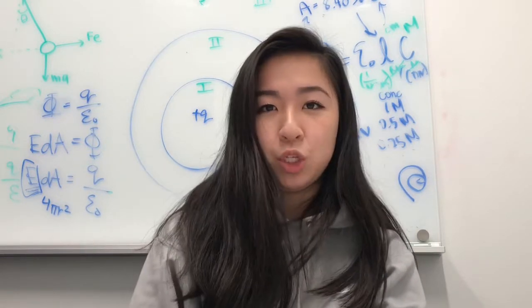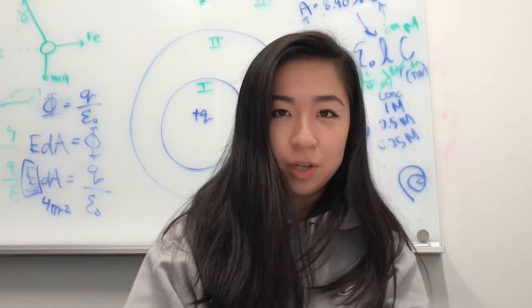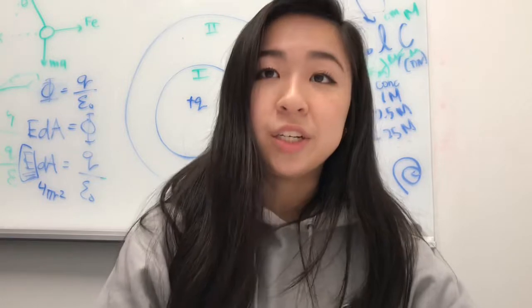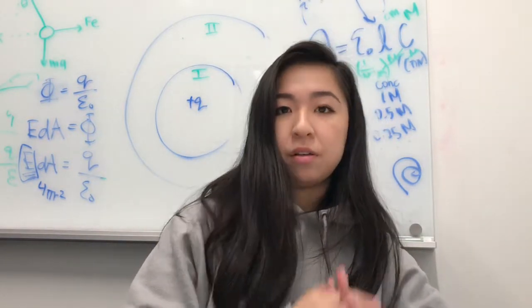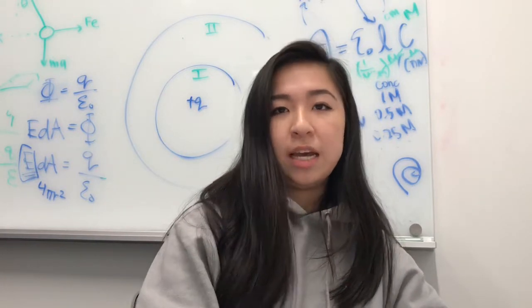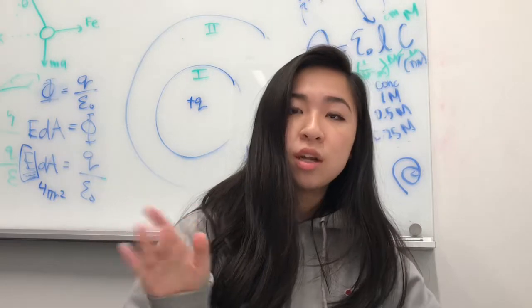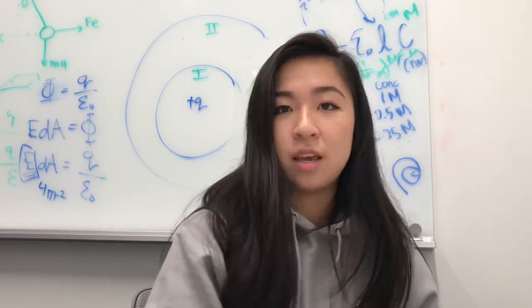I'm going to be doing my Postlab video number 1 for the crystallization of alum crystals lab. Crystallization is a physical change that forms large crystals in their pure state from their liquid solutions. Basically, the principle behind this idea is that increasing the temperature of a solution will also increase its solubility, or the amount of solute it's able to dissolve.